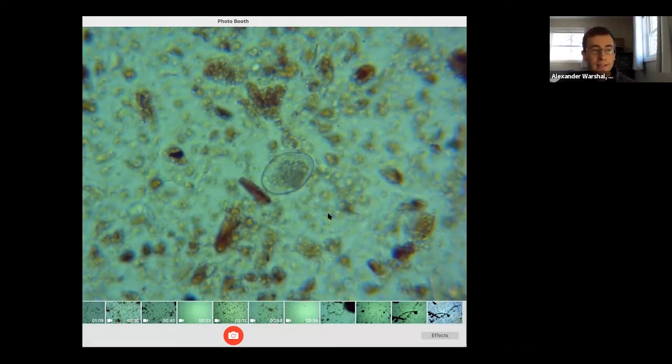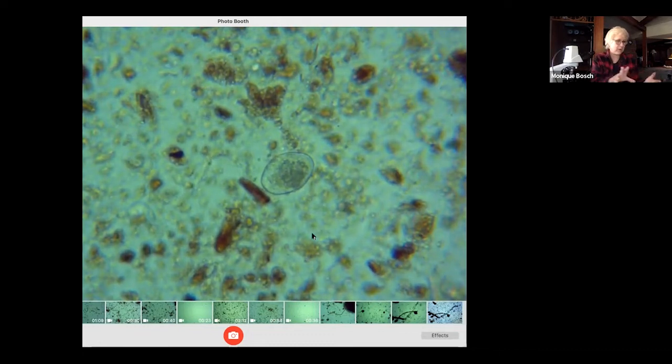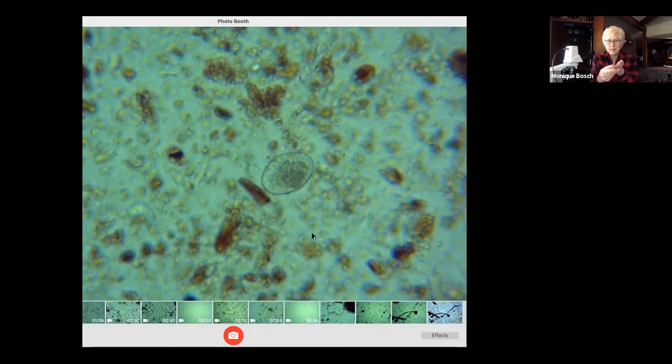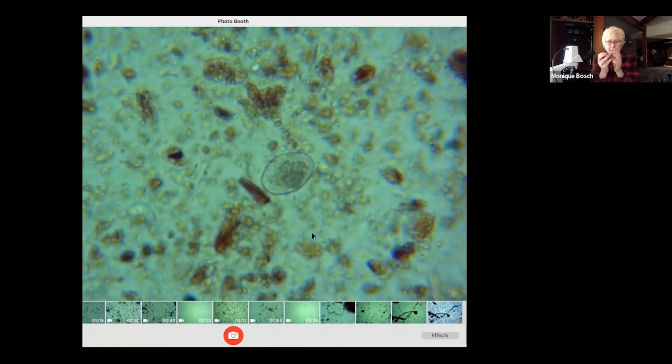Then Megan asks, when you're referring to aggregates, what is the aggregate an aggregate of? Oh, okay. So you see these guys here? There's a flagellate, by the way. And these aggregates are made up of bacteria. Bacteria are sticky. So if I did the whole talk on compost tea, I would tell you about spraying the foliage, because the bacteria will stick to the leaves and will eat any, for example, powdery mildew, and protect the leaves. So in this case, they are sitting in this compost, which is mature. They've gotten together and formed these aggregates.